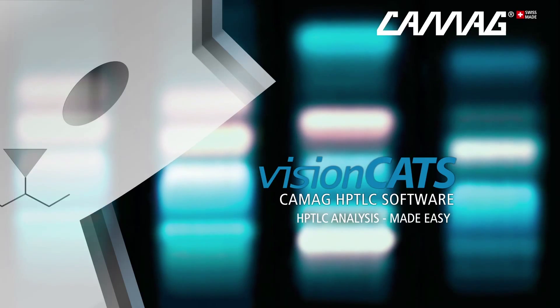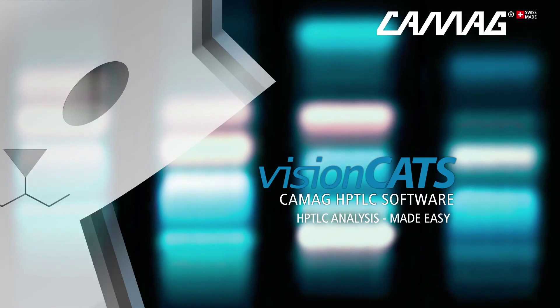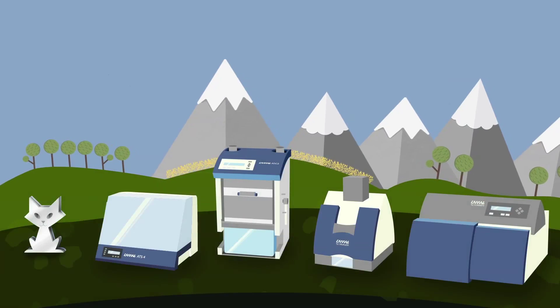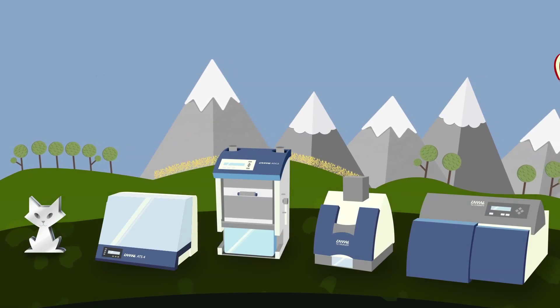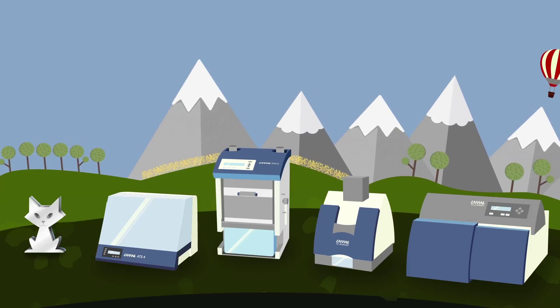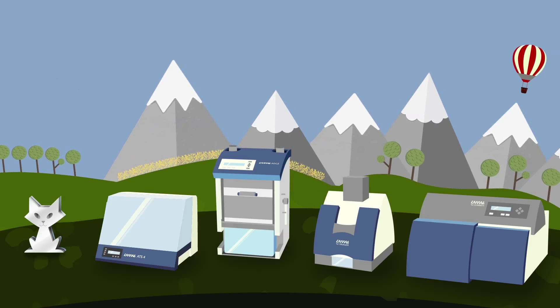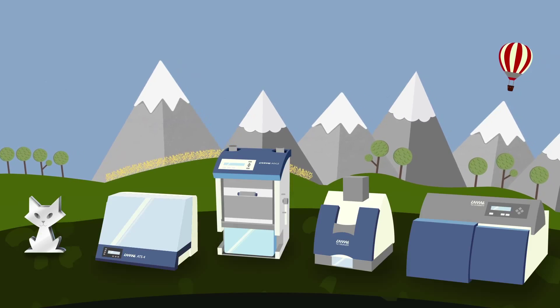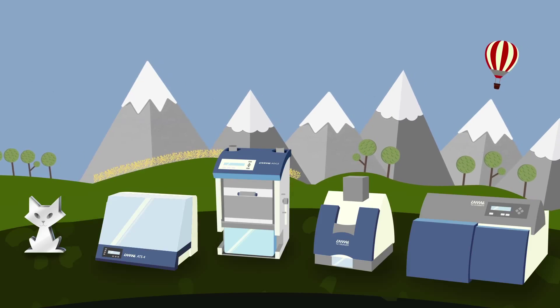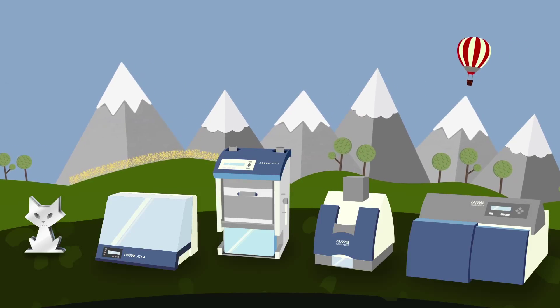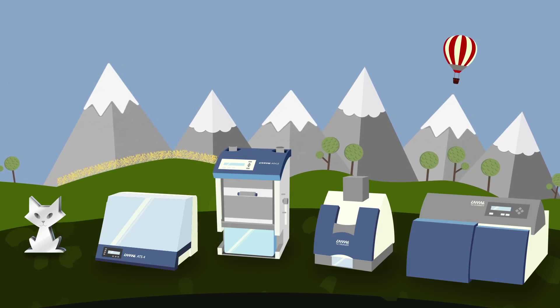HPTLC analysis made easy using KAMAG's VisionCats software. VisionCats HPTLC software stands for intuitive simplicity and takes high-performance thin-layer chromatography to the next level.